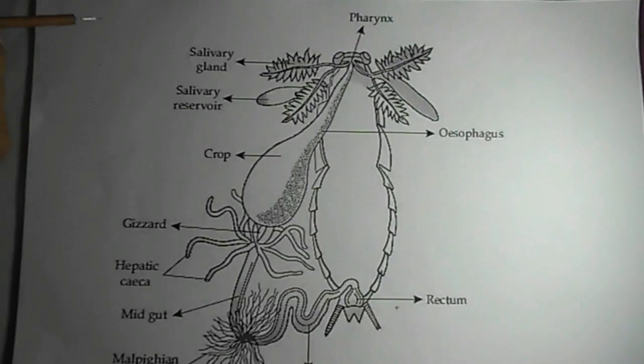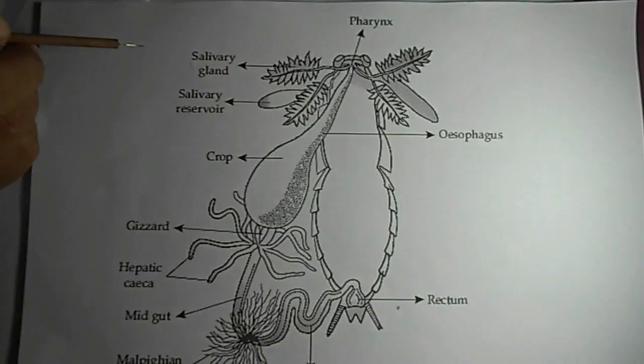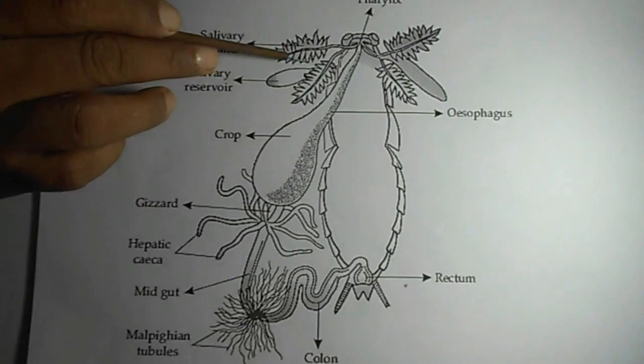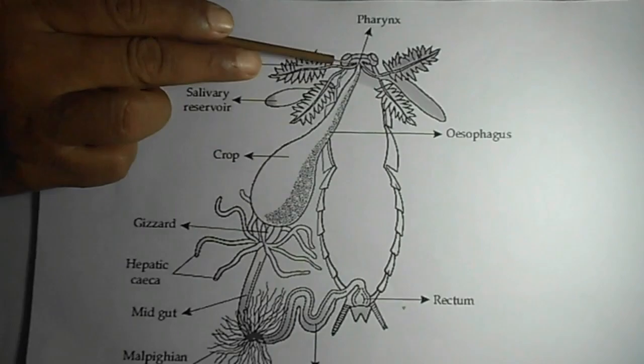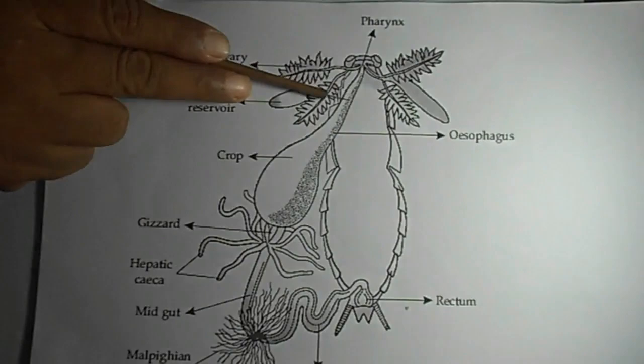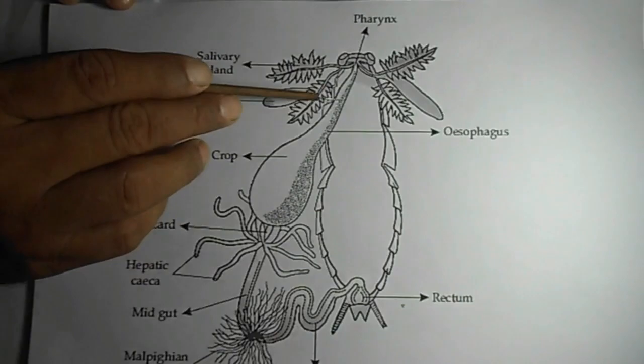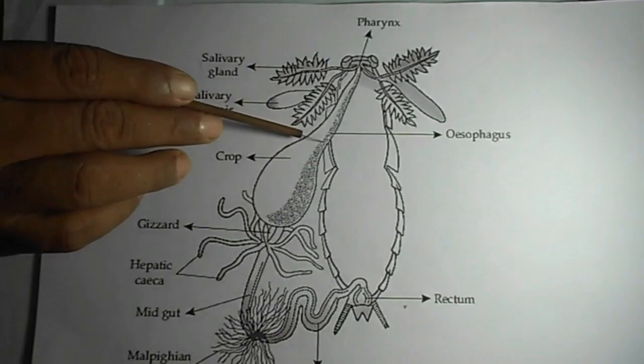The digestive system of cockroach consists of the alimentary canal and digestive glands. The alimentary canal starts from the mouth. Here we see the buccal cavity. From the buccal cavity, a narrow tube-like structure goes down called the pharynx, and this pharynx continues with a tube-like structure called the esophagus.